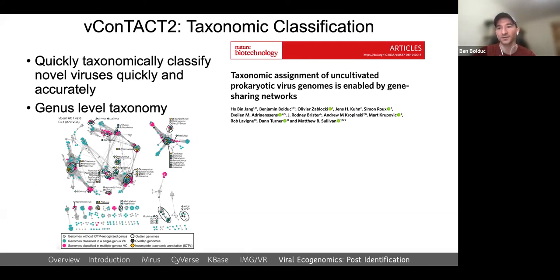processing viral environmental data, there are eukaryotic viruses identified in there. And yes, they are classified at the genus level, but I don't want to say anything more than that because this is recorded, so someone might try to call me out. I cannot say that it will work for eukaryotic genomes.